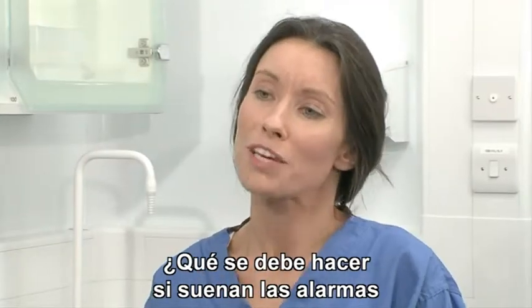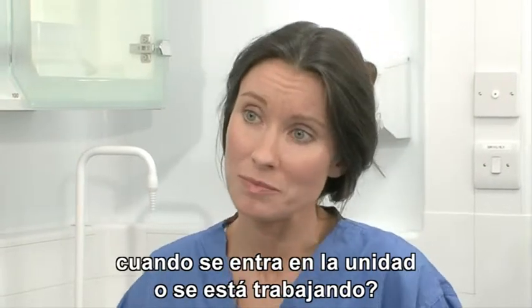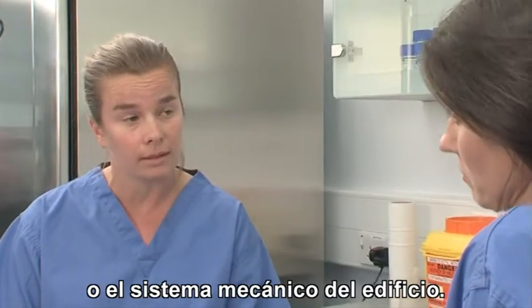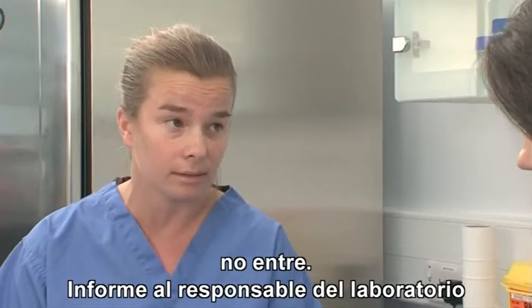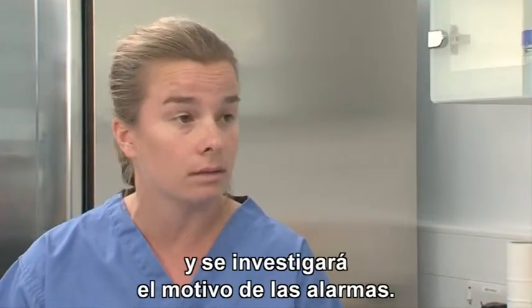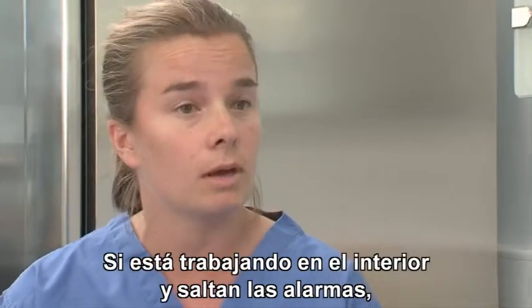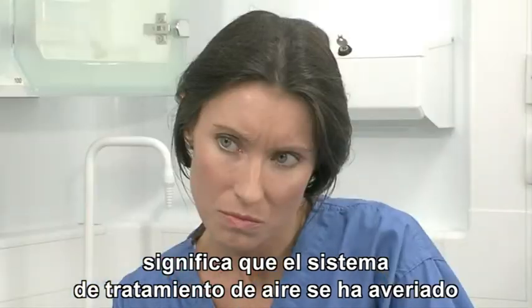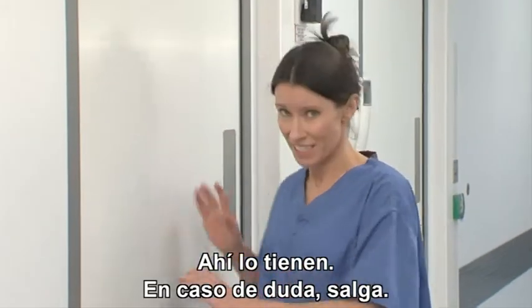What should you do if the alarms are sounding when you enter the unit or if they start sounding while you're working? The alarms indicate that there's something wrong with the air handling or something wrong with the mechanical handling of the building. If you go to enter the building and the alarms are sounding, do not enter. Report to the building officer and the reason for the alarms will be investigated. If you're working in there and the alarms go off, the same applies: it means the air handling has gone wrong and you will need to remove yourself from the contained facility. So there you have it. If in doubt, get out.